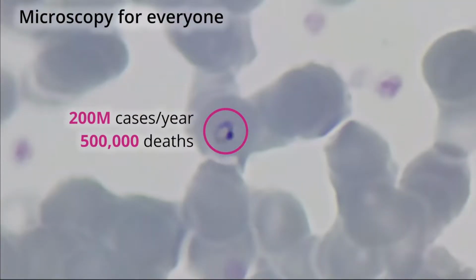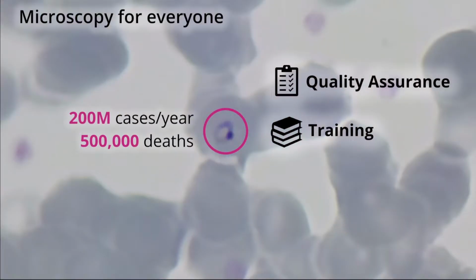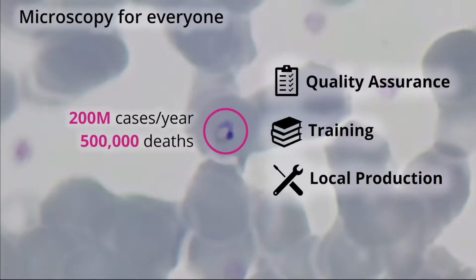The OpenFlexure project creates a digital microscope that is highly automated, and it has a lot of advantages. We can do better quality assurance of diagnosis because it keeps proper records. We can train technicians better because they're able to seek a second opinion when they're unsure, and because they're able to point at things on a screen rather than that classic microscopy challenge of looking down the eyepieces and not really having any idea of what the other person sees. And lastly, it's designed to be produced locally. And that is so key to getting around a lot of these sustainability issues where I can make a very cheap, very good microscope, but if it breaks once it's in the community that need it, it's not very useful.